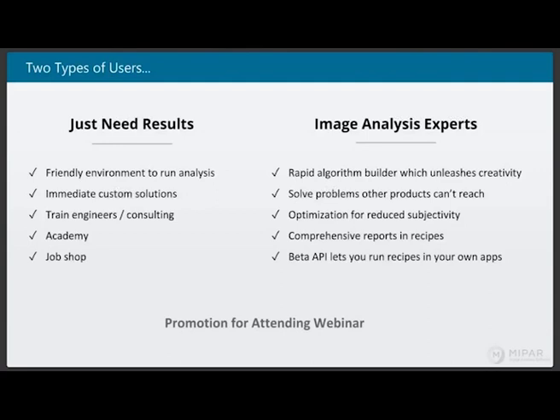So there's one more question. Yeah. If there are 4 mineral phases and they're of different colors, how do you measure the area of individual minerals?